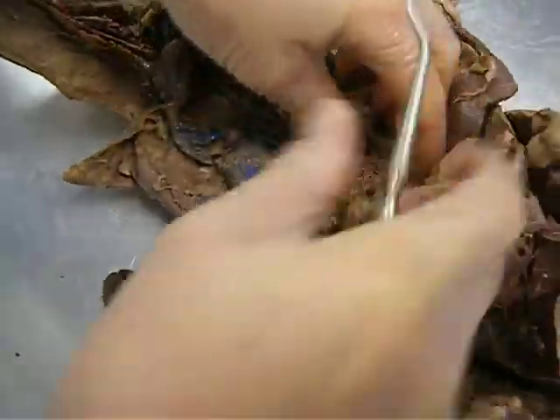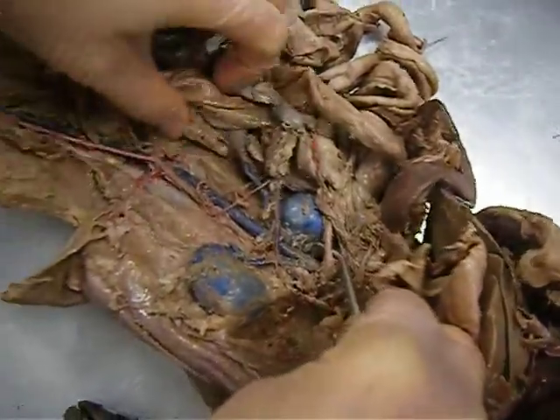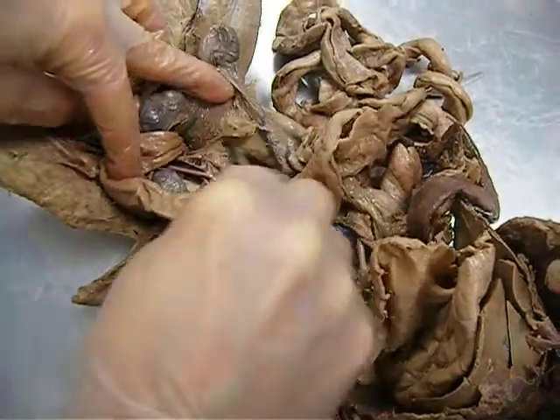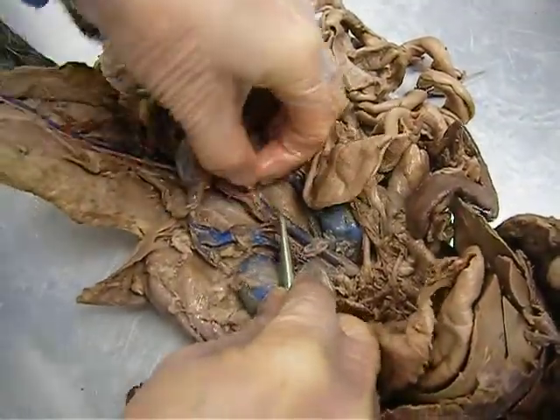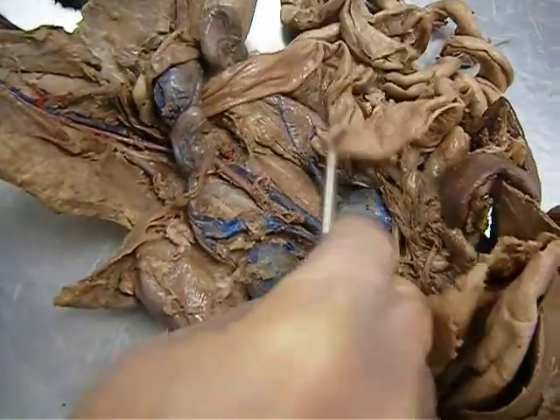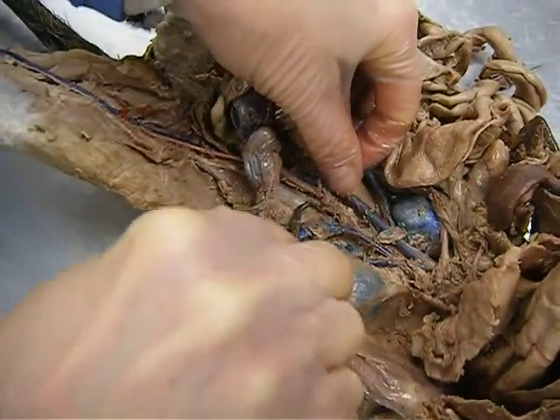Right below the celiac, I forgot that, is cranial mesenteric, and farther down is caudal mesenteric. I just saw him. Oh, you cut it. That's that little nub right there. Both the caudal and cranial mesenterics go to the intestines. This is the vena cava, and this is the aorta.